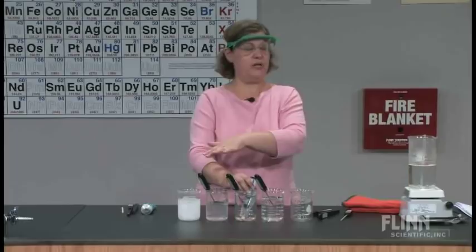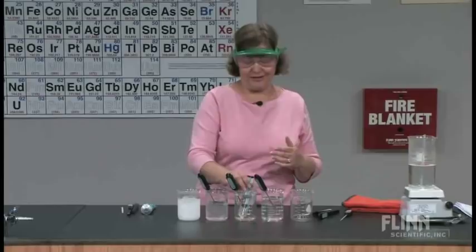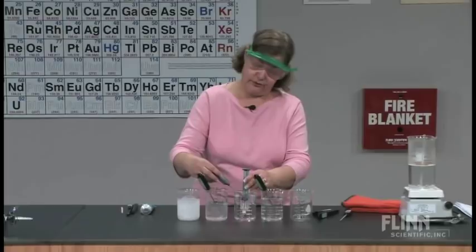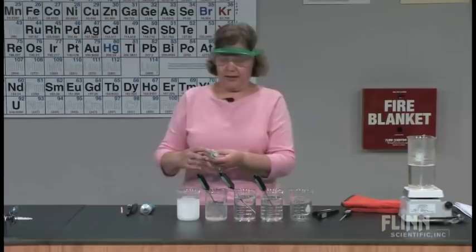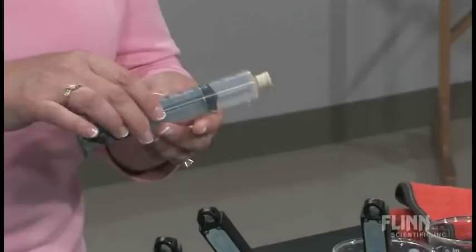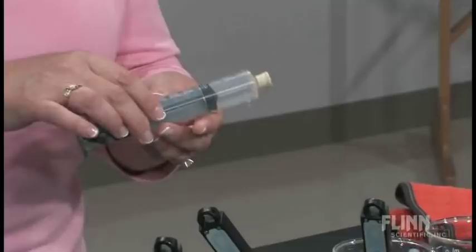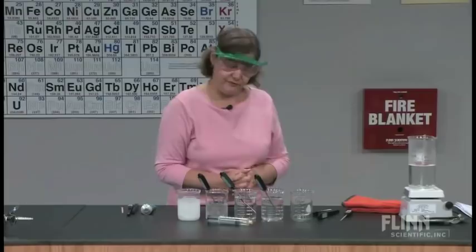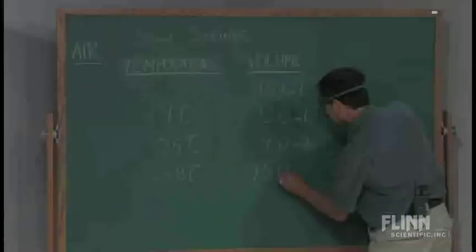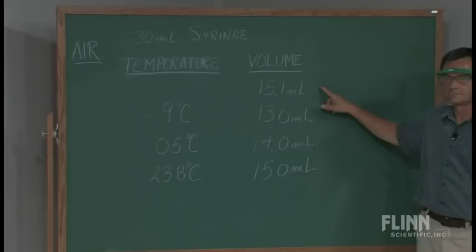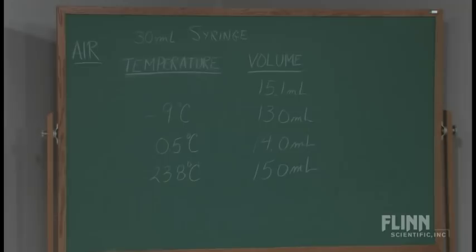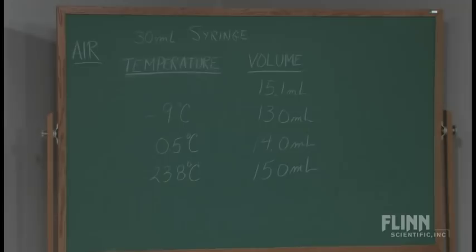Because everybody's starting with a different initial volume, you can't plot them all and draw a single straight line, which would be really nice. This bath is at 23.8 degrees — room temperature. I'm going to withdraw it, push it in, and let it naturally go back — and that's the point of lubricating it. We'll set that one down so we can read it. That's 15.0 milliliters. There's some nice internal consistency here: the 15.1 I measured at room temperature before putting it in any water bath is very close, so we're at least internally consistent.